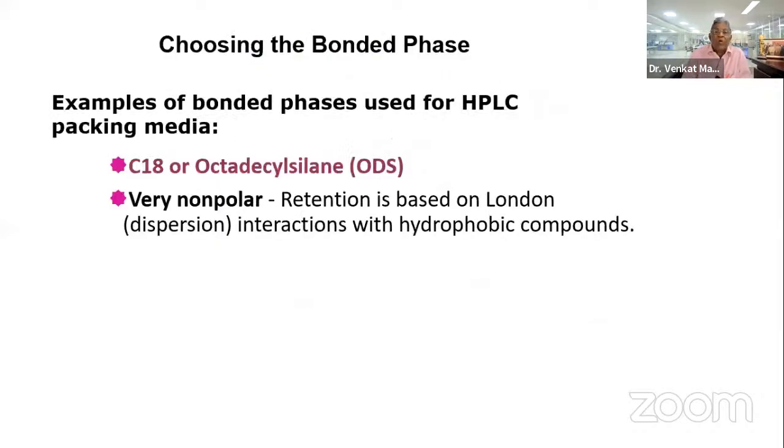Good. Now, how to choose the column? I will start. I will not talk much because in many of the applications, we use a reverse-phase column. What is a reverse-phase column? Very simple.